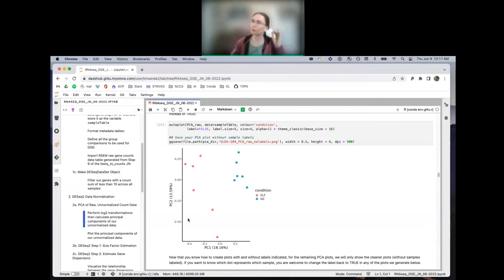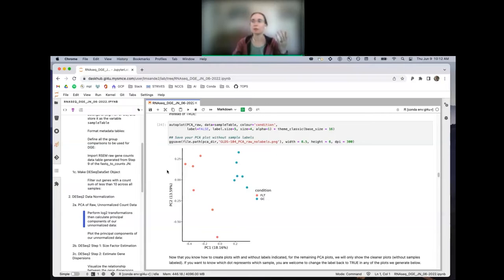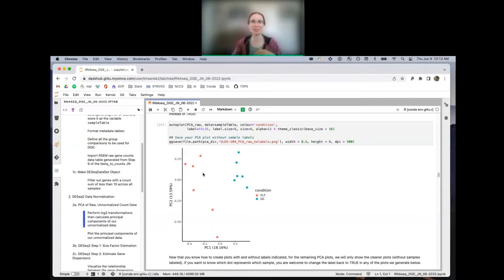When I look at PC2, the separation vertically is not separating on biological condition — the biological conditions are separating horizontally, not vertically. So when I look vertically, there's some other source of variation explained by PC2. This is why we're using this data set — there isn't a lot of head scratching. It's very nice, very straightforward. If you know what this looks like, then with a more complex data set, it can be a nice comparison.